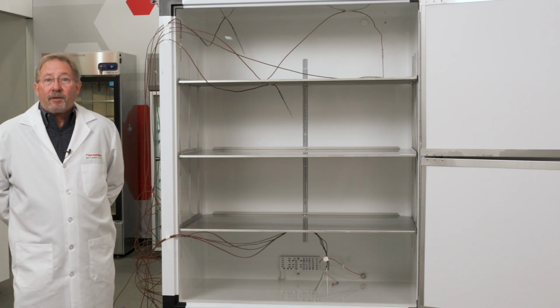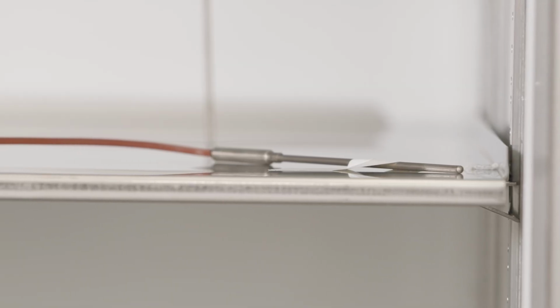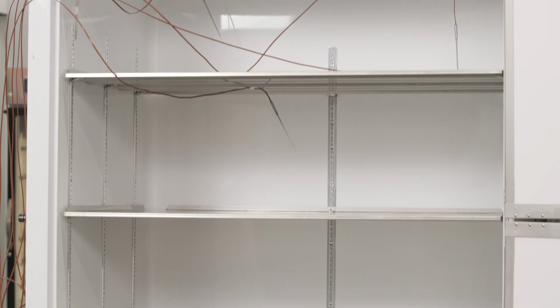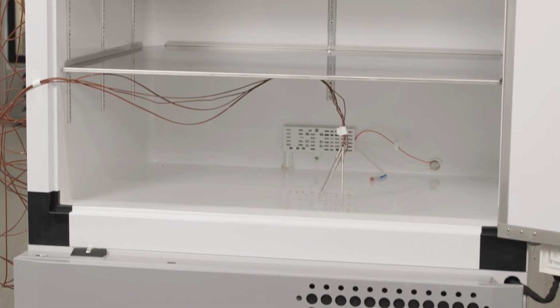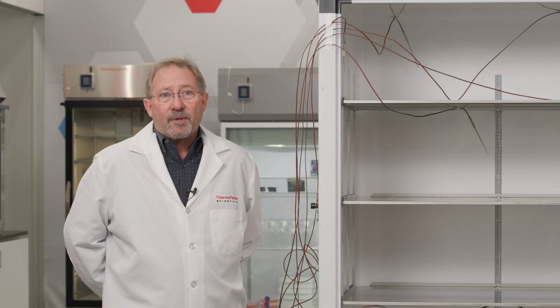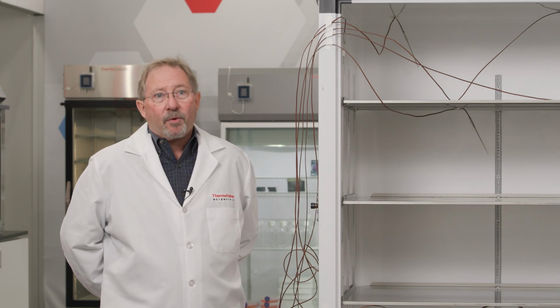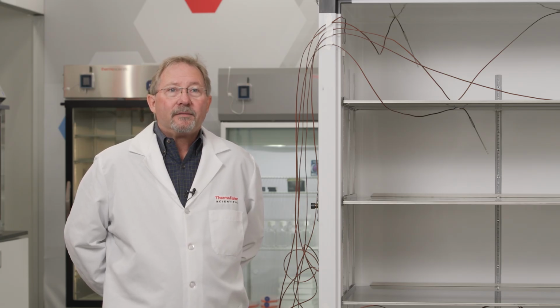If you look closely, the probes are not uniformly placed, and there are a few that are touching solid surfaces like the wall of the freezer or a shelf. This setup will most likely produce incorrect results and will possibly fail the test. It won't be a fair representation of the condition of the freezer. Be sure to consult your mapping protocol that should explain in detail where your probe should be located.